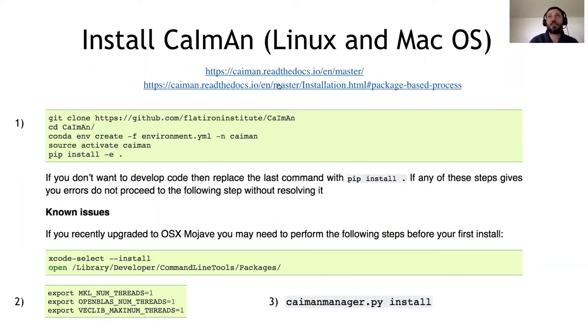All the instructions are at this link that I also paste in the chat if you want to have a look at it. But basically what you do, you can just clone CaImAn. This is the installation, not for developers, just for using CaImAn. You clone the repository, you enter into the folder of the repository. And then by running this command, you will create an environment automatically that is called CaImAn and which contains a set of packages that are necessary for CaImAn to work.